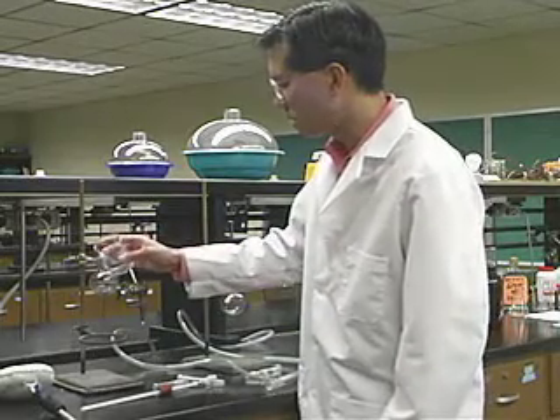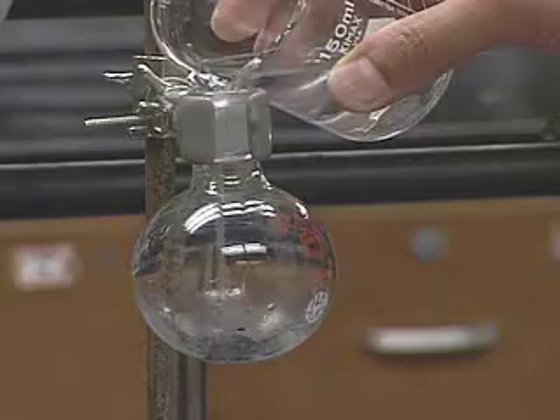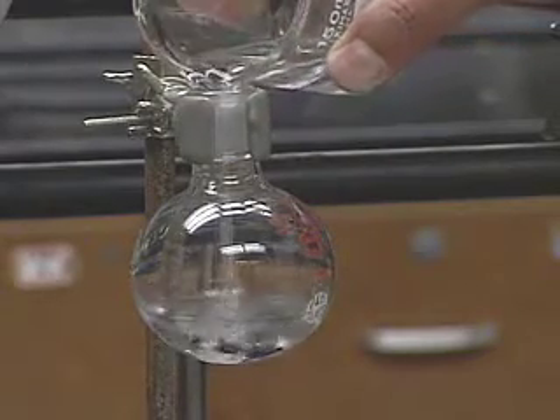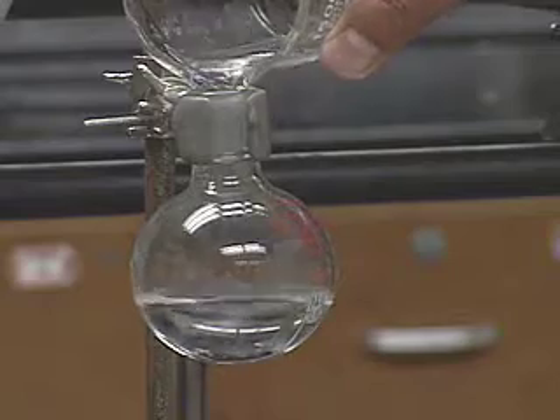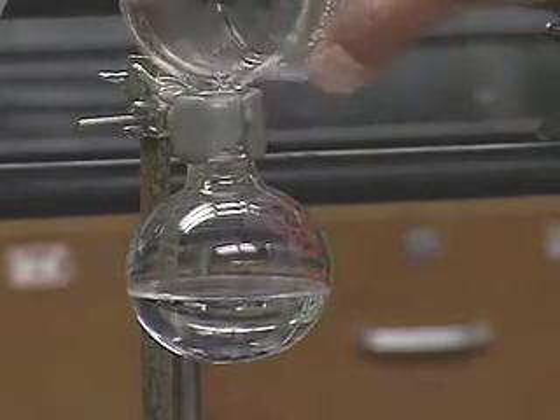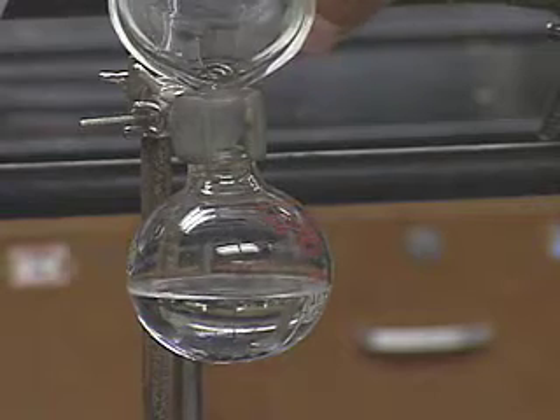So I have some ethanol here and I'm going to pour it into the round-bottom flask. The round-bottom flask already contains some magnesium shavings. Being a 100-milliliter round-bottom flask, you can put about 50 milliliters in. You never want to fill the flask more than half-filled.